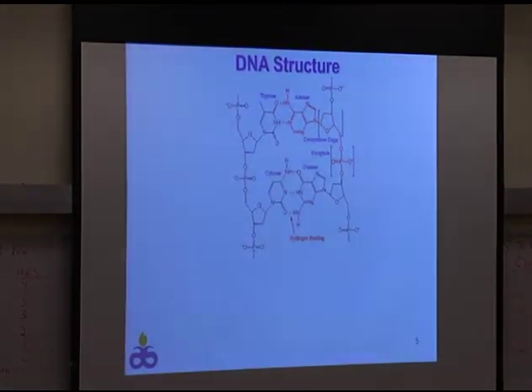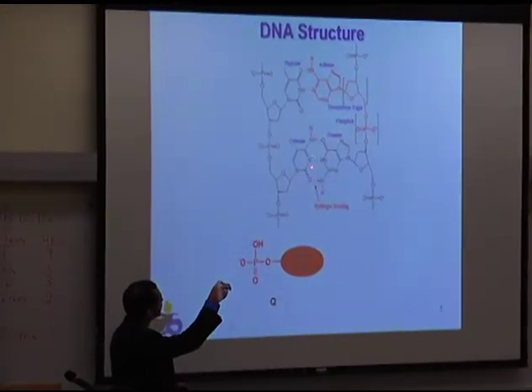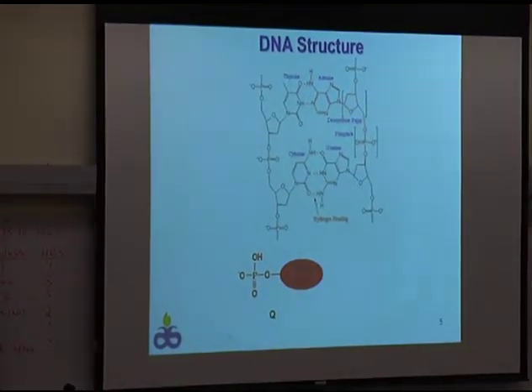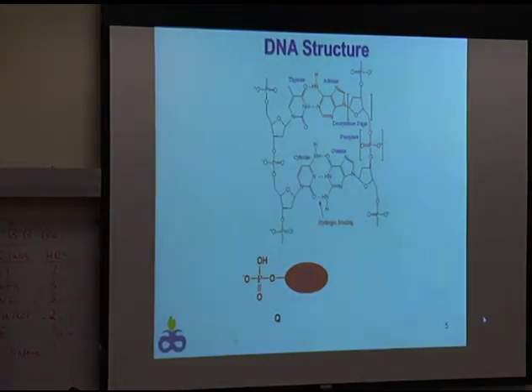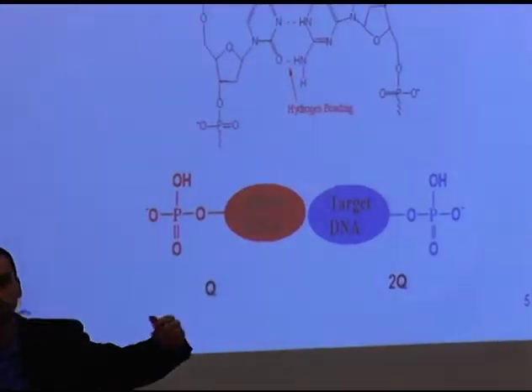So let's imagine we have a sequence of DNA, we'll call that the probe DNA. This is already attached to the sensor, this side. And then we have target DNA on this side. This is in solution, this is our sample. For example, a patient's sample. And if that probe DNA is complementary to the target, we say it hybridizes.